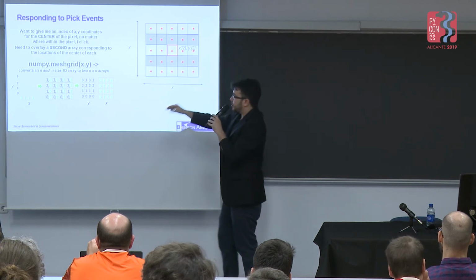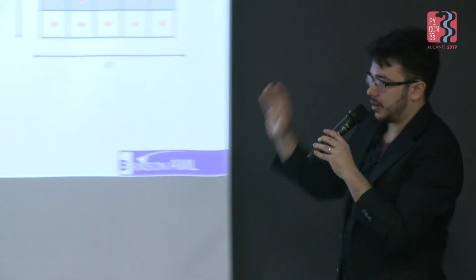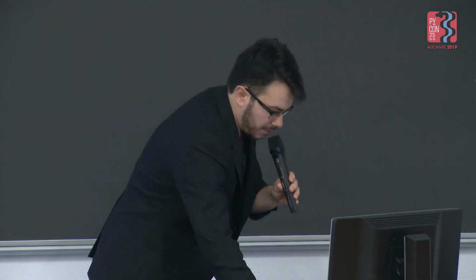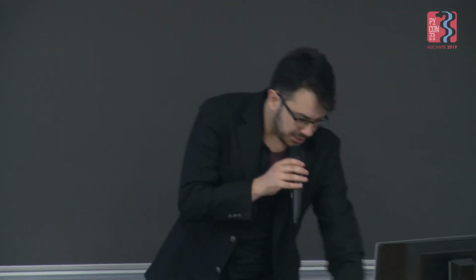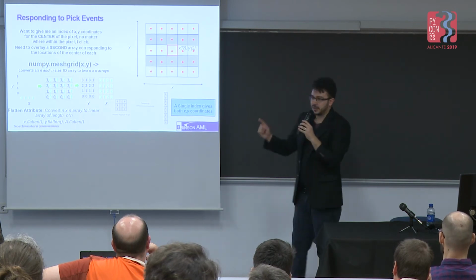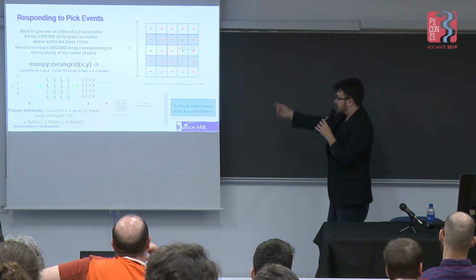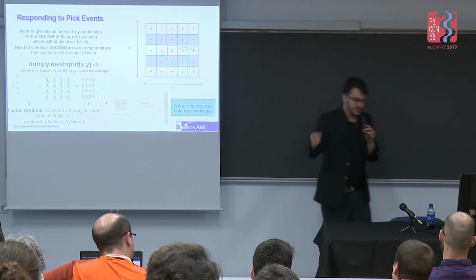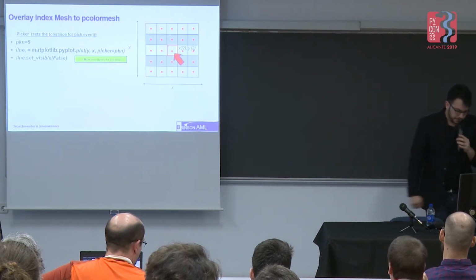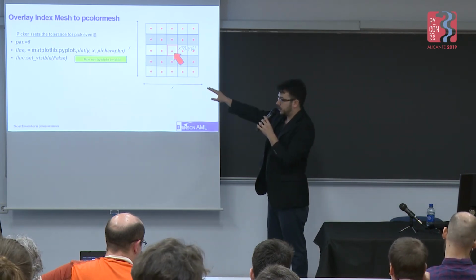It basically makes two 2D arrays that give you the X and Y indices at each point in the two-dimensional array. And then once I do that, I use the flatten attribute to turn that 2D array into a one-dimensional n-squared array, and then I get two one-dimensional arrays where a single index will give me both the X and Y coordinates of the image, as well as the corresponding index that's related to the mechanical property data.